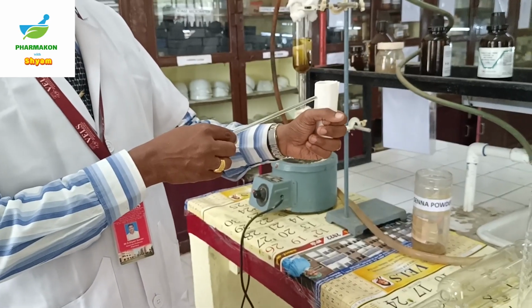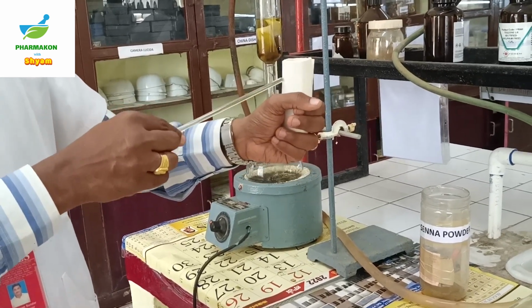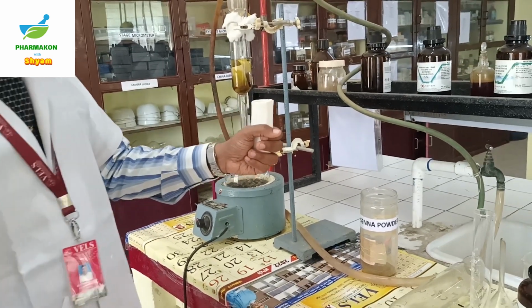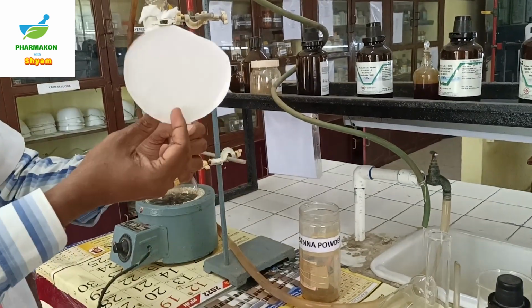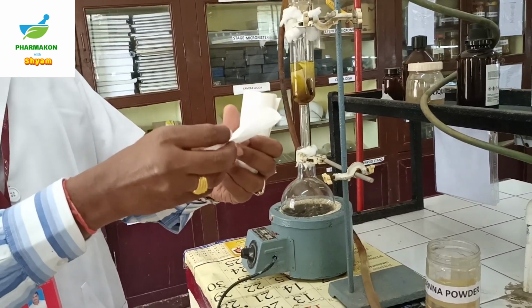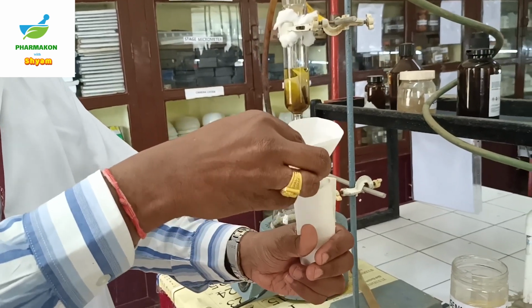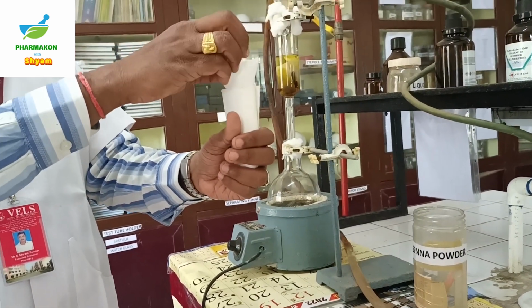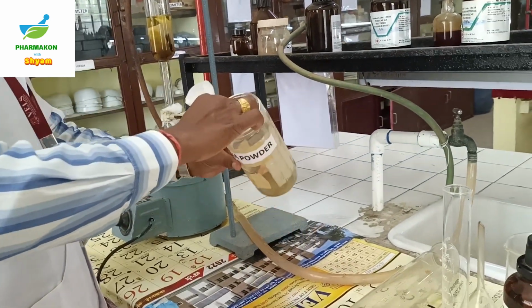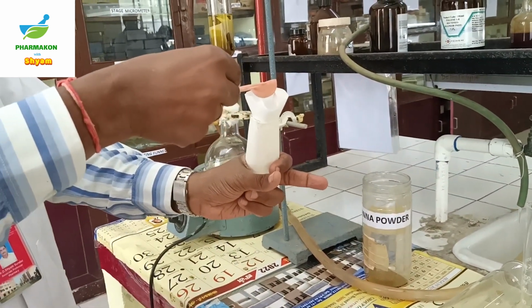Step 3. Packing the drug material into the thimble. This is an example of a thimble, which is made up of 90% cellulose. Take a Whatman filter paper, size number 40, and roll it in the form of a cup. Place the Whatman filter paper onto the thimble and transfer the required quantity of the drug into the Whatman filter paper.